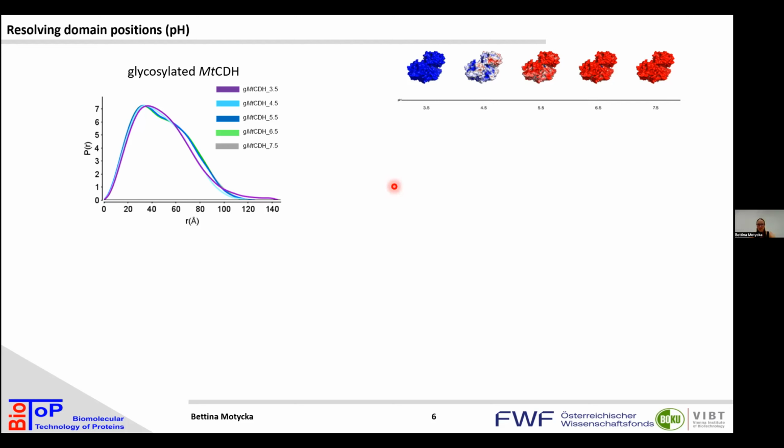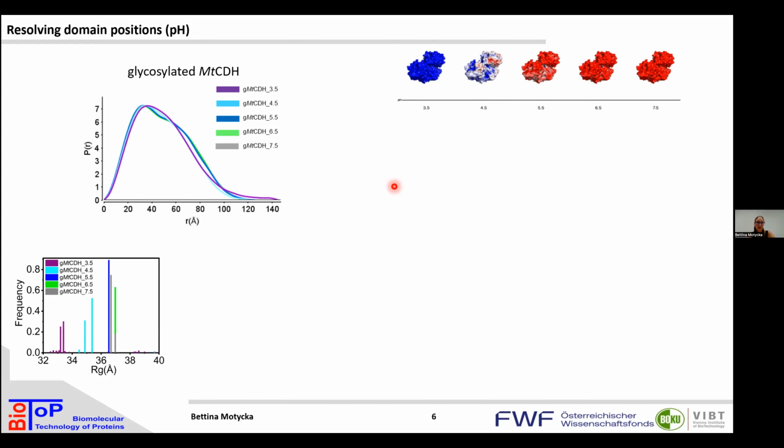But in our case, we found out that this two-state modeling approach is the best, indicating that we don't have one conformation, but maybe some differences. And then what we did next to visualize it, we made a plot. We took the best 50 approaches for all conditions and plotted them in a histogram shown here, the frequencies versus the radius of gyration.